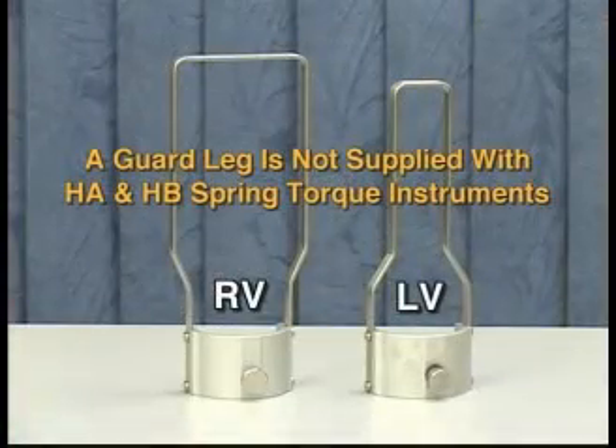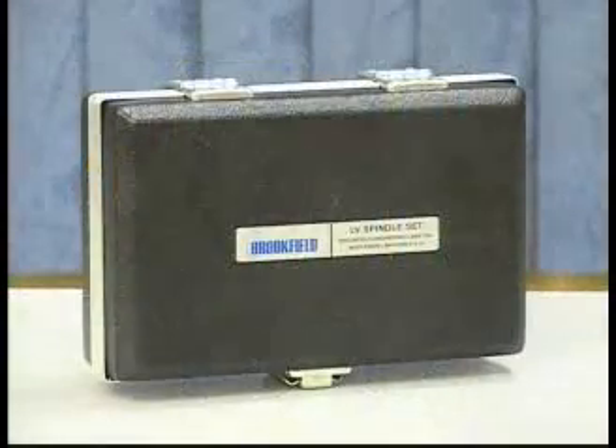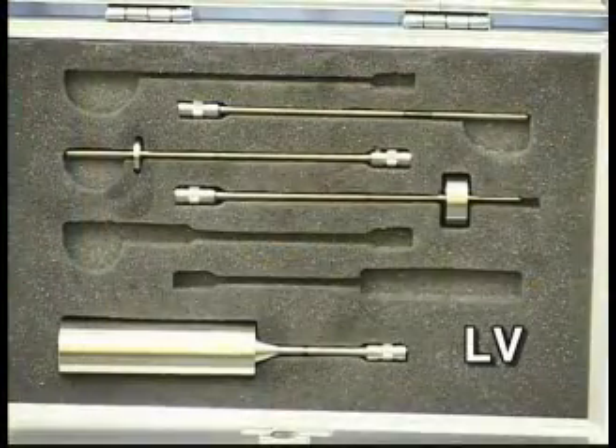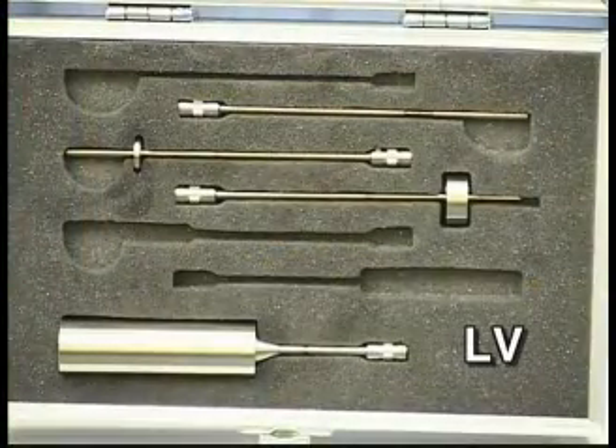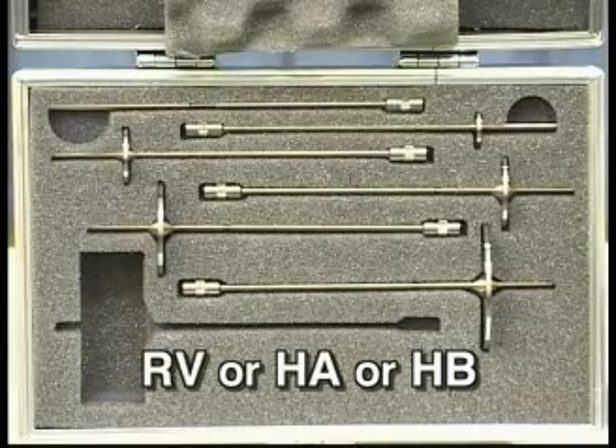Note that RV guard legs are wider than the LV guard leg. Inside the spindle case, you should see four spindles if you purchased an LV torque range viscometer, and six spindles if you purchased an RV, HA, or HB torque range viscometer. Once you are sure that you have received all the necessary parts, you are ready to begin assembling the components.